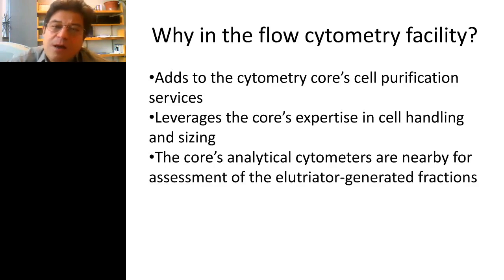The flow cytometry core laboratories typically are doing analytical work, but a large portion of their work is involved with cell purification. And we see elutriation, which is obviously a purification technique, as something that would make a lot of sense in a core environment. This technology is fairly mature. It's been around, as I pointed out, since the first commercial instrument in the 70s. More often than not, elutriation has been used for specific experimental goals for a particular application.